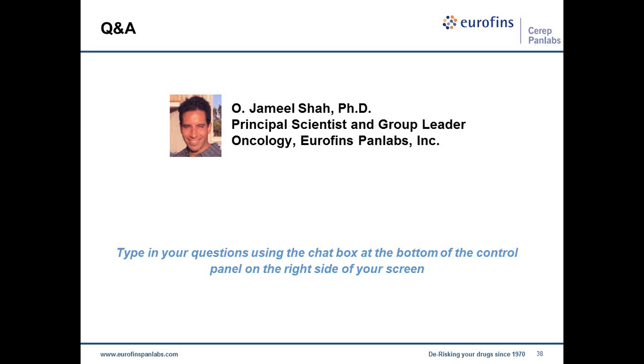So the first question is, in the Oncopanel cell lines, do you have them classified according to RAS, P53, et cetera? What I can say to this is that we have genomic information covering about 1,600 genes for all 240 cell lines.